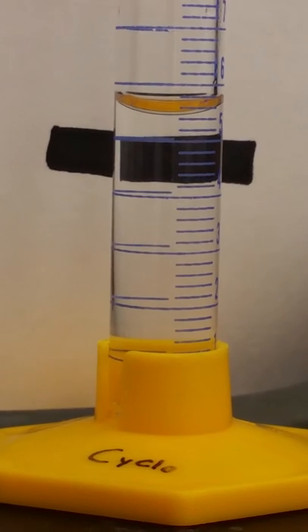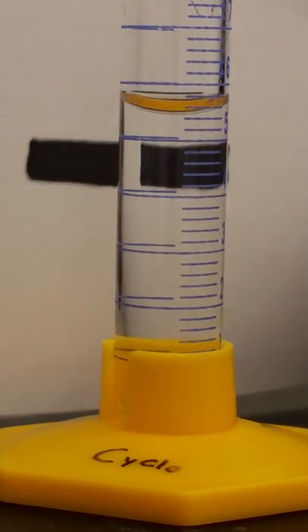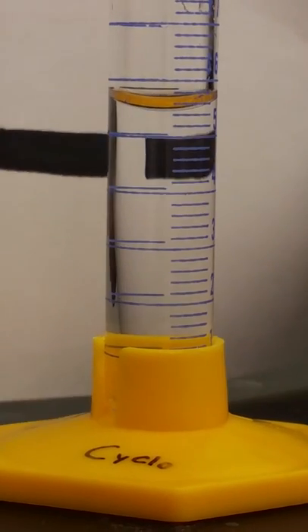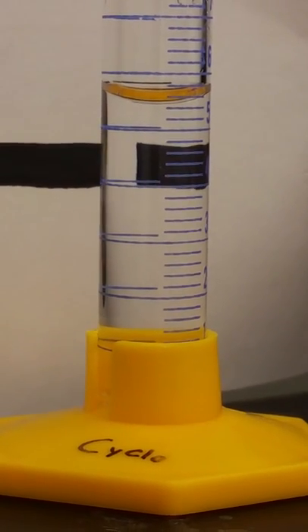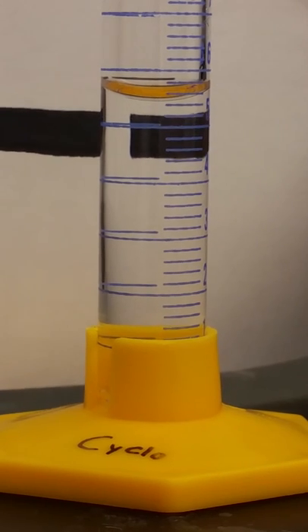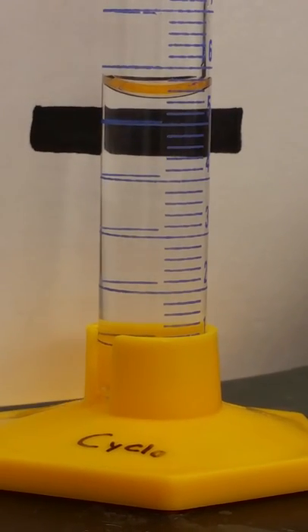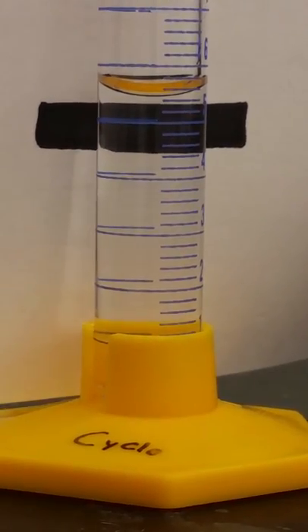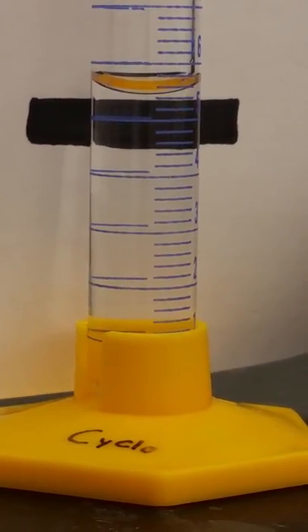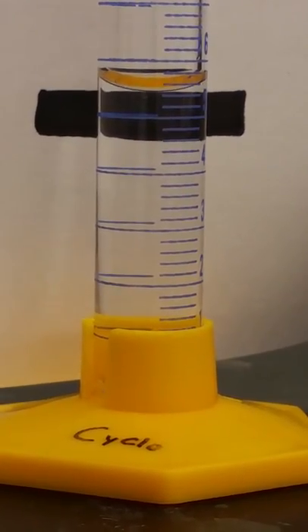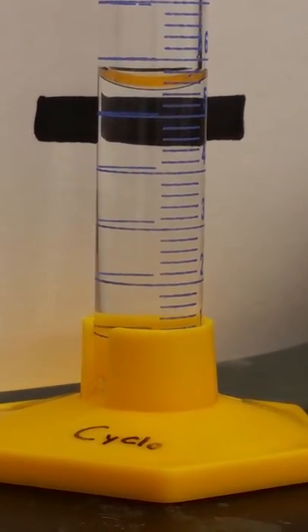And because I can guess the next one, these graduated cylinders are measured to, or precise to, the 0.02. So looking at my volume, I'm going to say that it is 5.44 because it's less than half, so it's not 0.5 quite yet, and it's closer to the 0.4 mark.